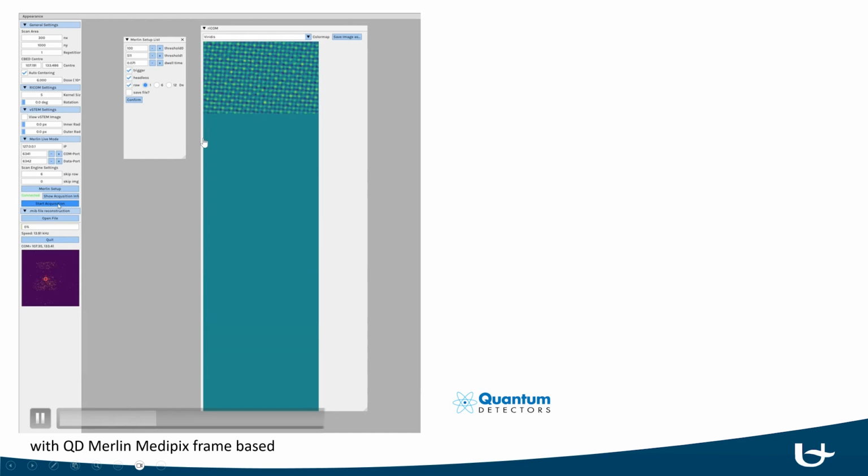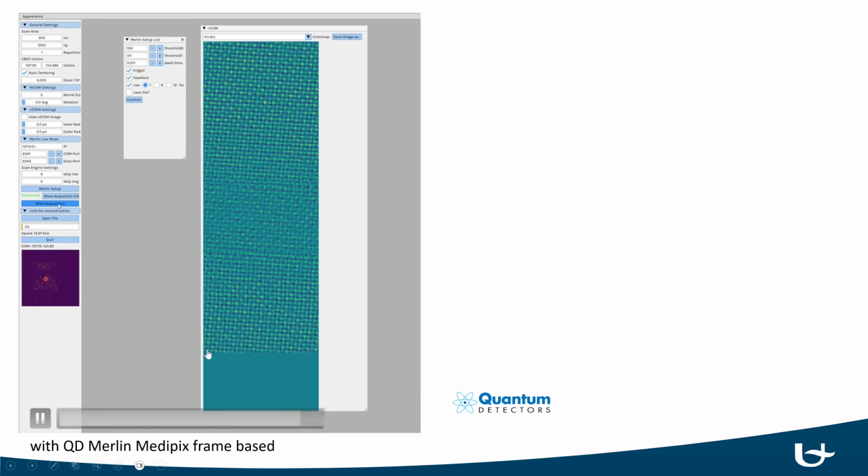A little bit as you used to see from any conventional STEM image, but behind the scenes now every pixel is a diffraction pattern that you see here. And now we can start focusing, for instance, this material. So now we bring it in focus, and I think later it will go out of focus again. This is the kind of convenience you were used to with HAADF imaging, which you can now get also with the benefit of 4D STEM.